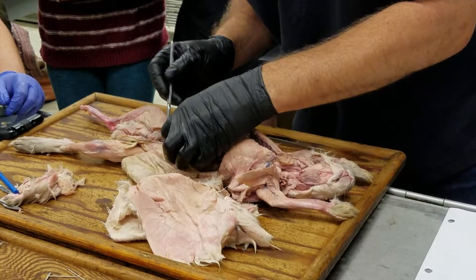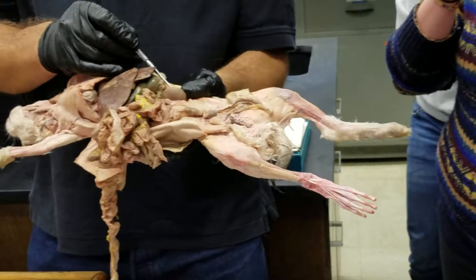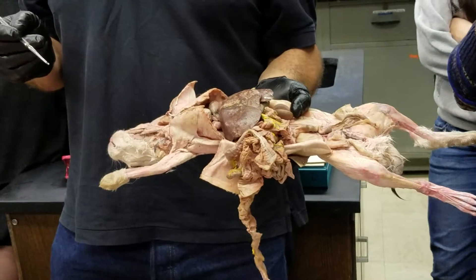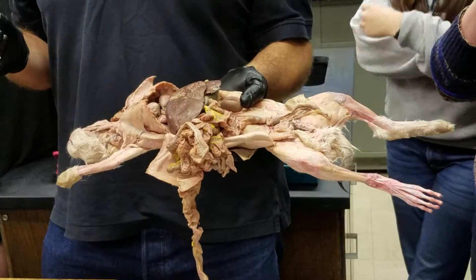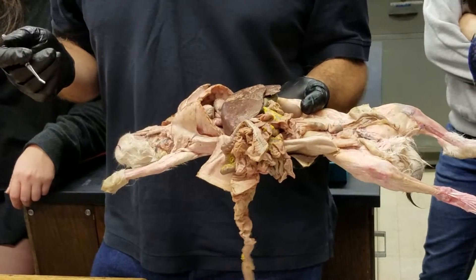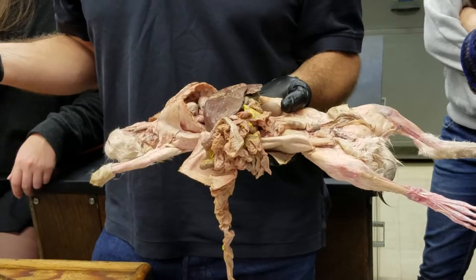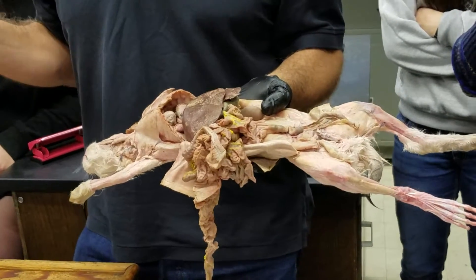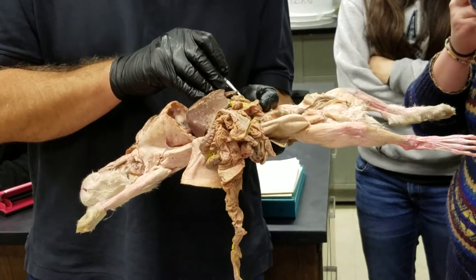Now on to mammals — we'll start with the urinary system. The kidneys are on each side. In mammals we find a metanephric kidney, which is bean-shaped — kidney-bean shaped, amazingly. It is metanephric, which means it's drained by a ureter. All amniotes have metanephric kidneys drained by ureters, while all amphibians and fishes have opistonephric kidneys of various sorts, drained by arcanephric ducts.